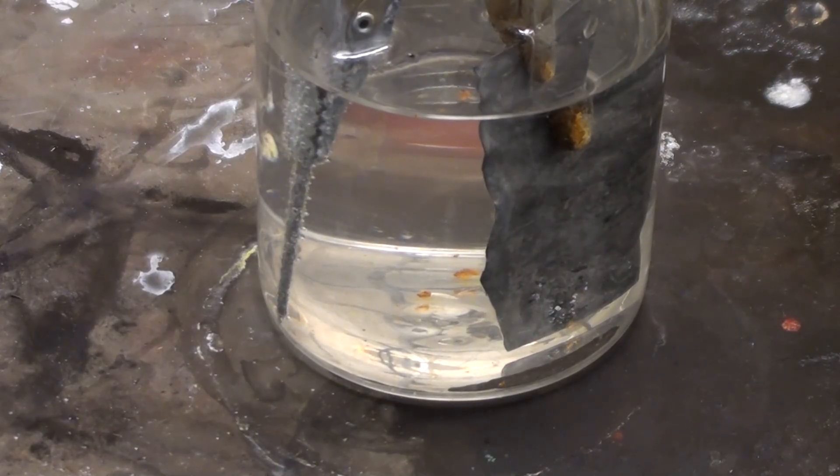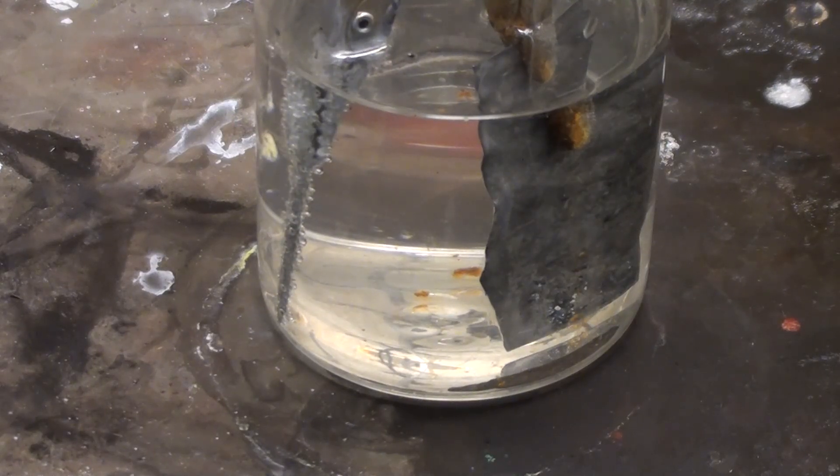The positive terminal with the zinc strip is dissolving and putting zinc ions into solution, while the negative terminal is reducing the zinc ions and plating them onto the nail as zinc metal. Some hydrogen is also released and can be seen as the bubbling around the nail.